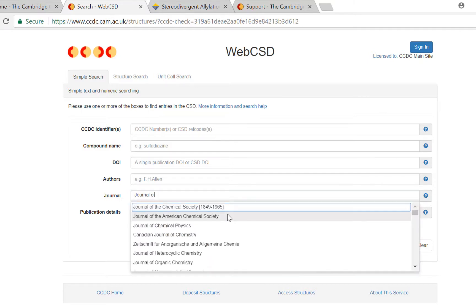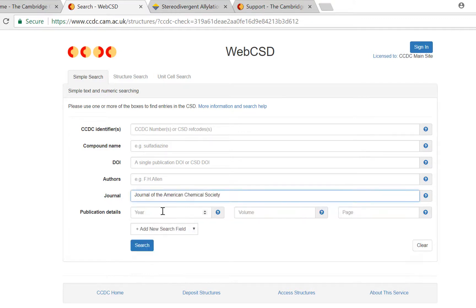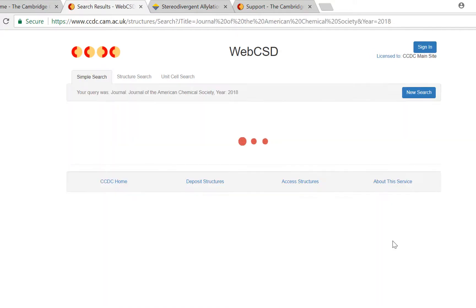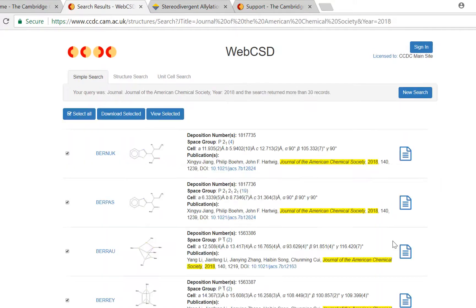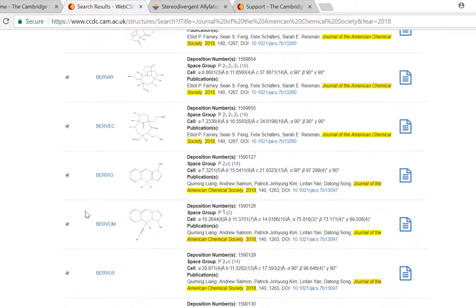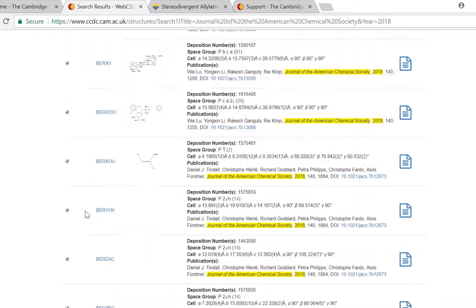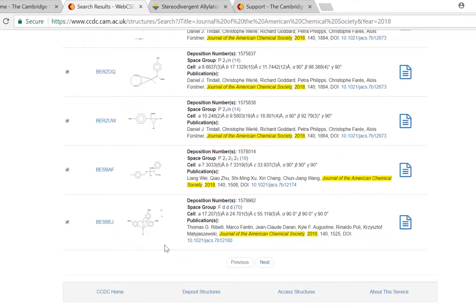So into the publication search box I type in Journal of the American Chemical Society and into the publication details year search box I'm typing 2018. So here's the first 30 results for the crystal structures that have been published in JACS. You can scroll through the results pages using the previous and next buttons at the bottom of the web page.